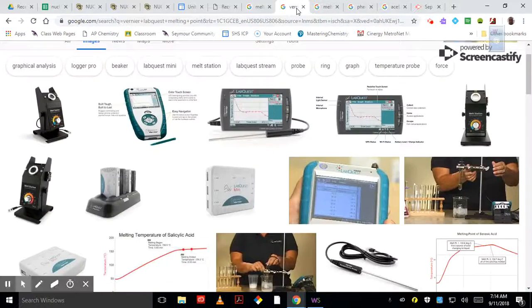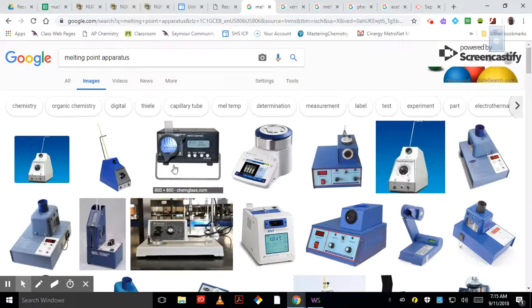So in that melting point machine, when you get back to our picture, there's that little bitty bit down in there. You don't want very much in there. The more you put in there, it really will screw up your melting point. You just want a little bitty bit to melt so you can tell at what temperature it melts.